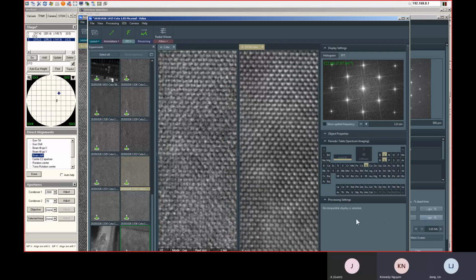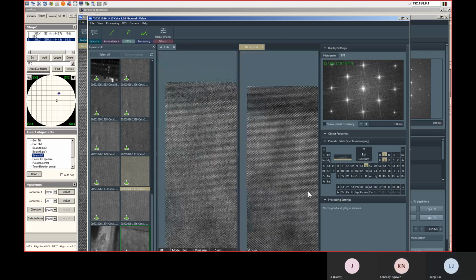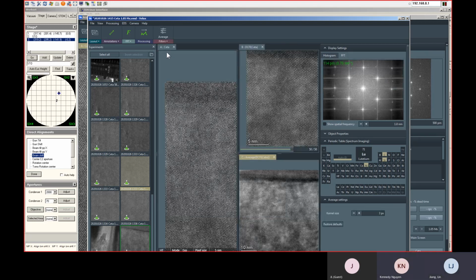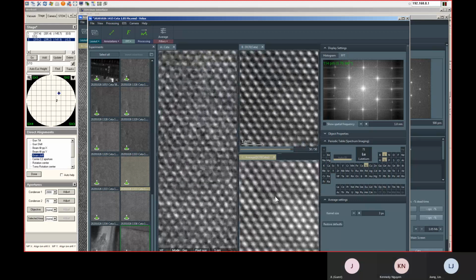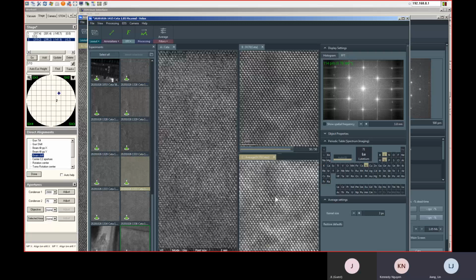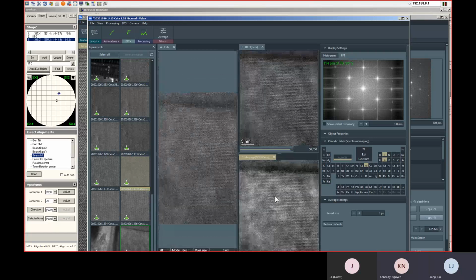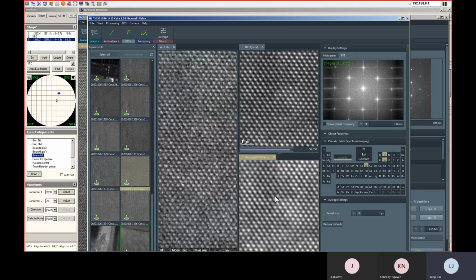Yeah. Cool. Yeah, so that looks pretty good. I'll try the filters. Let's see. The same. Wow. You use the average filter, right? Yeah. Did it look worse? Oh no, it's a little better. It's improved your signal to noise ratio of your imaging, basically.